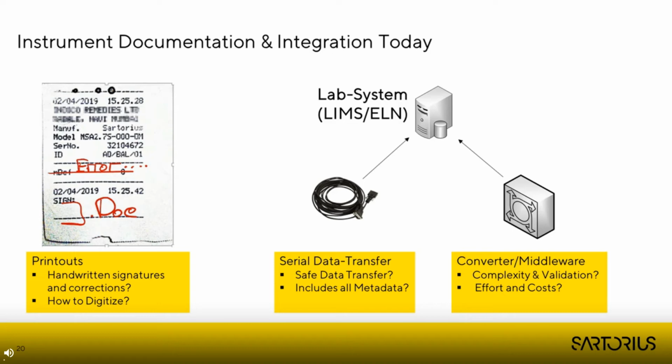When you have maybe a deeper integration, then quite often you have some kind of converter or middleware in between the instrument and the lab system, so that the instrument is only connected to this vendor-specific software, and then the software is integrated into the lab system.